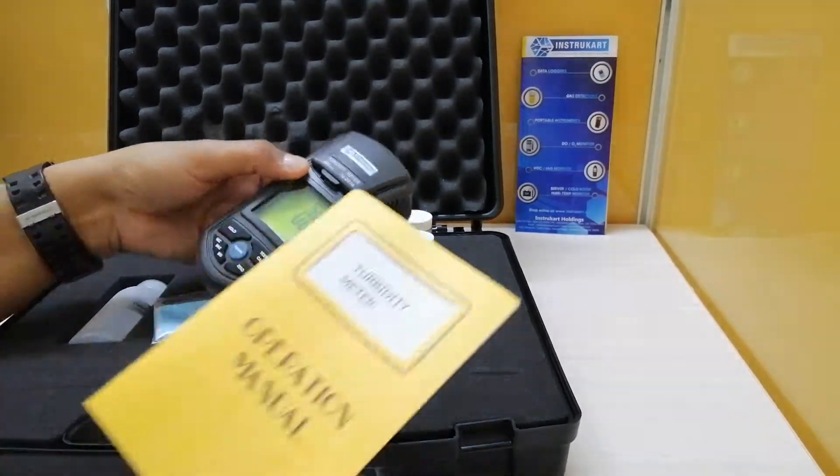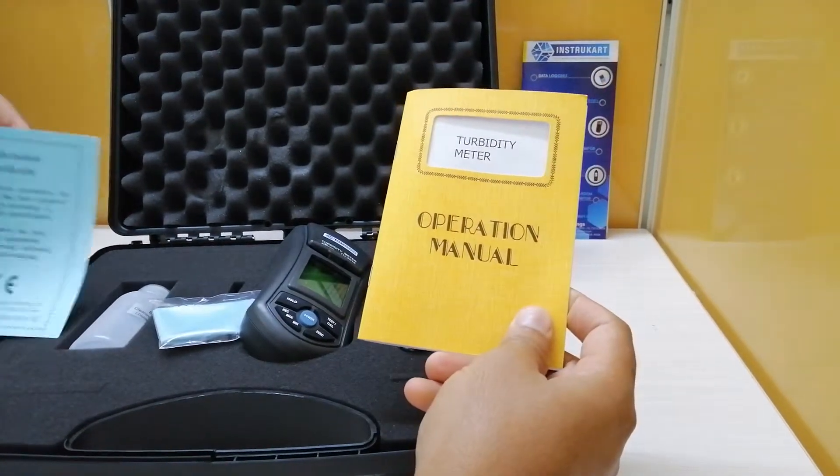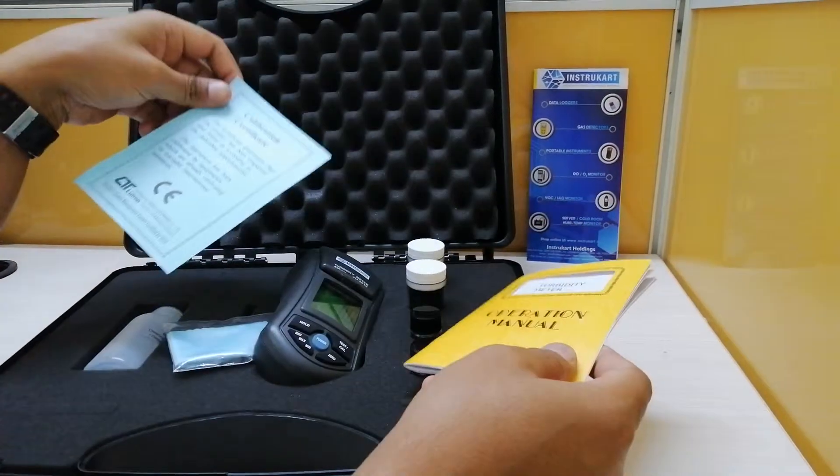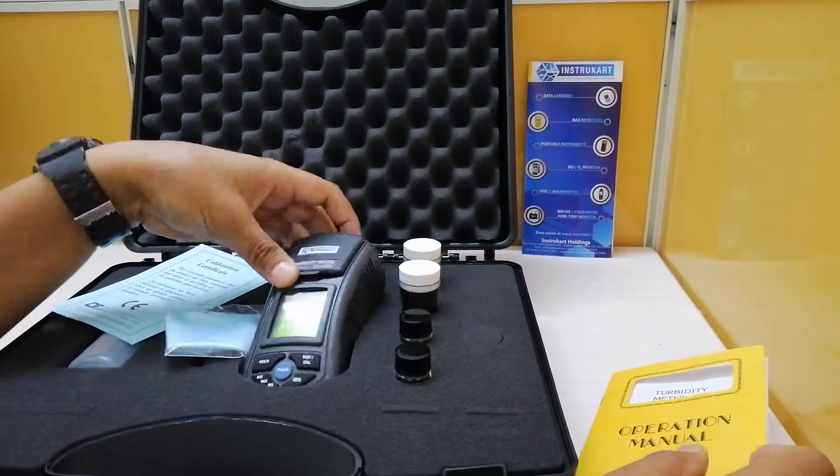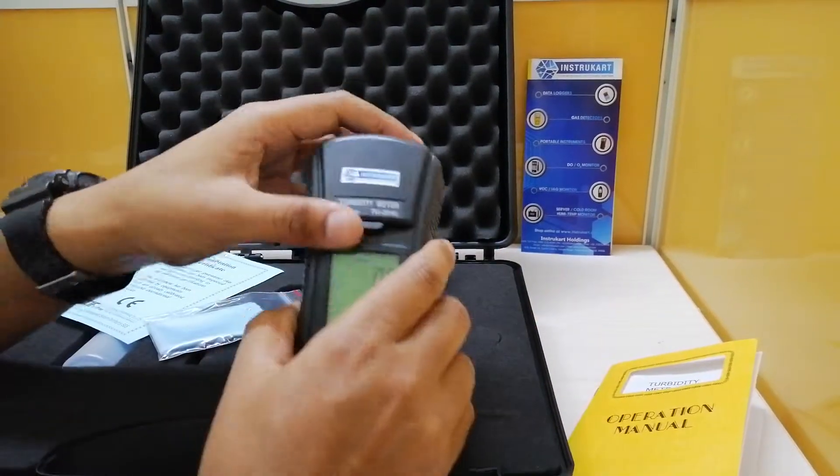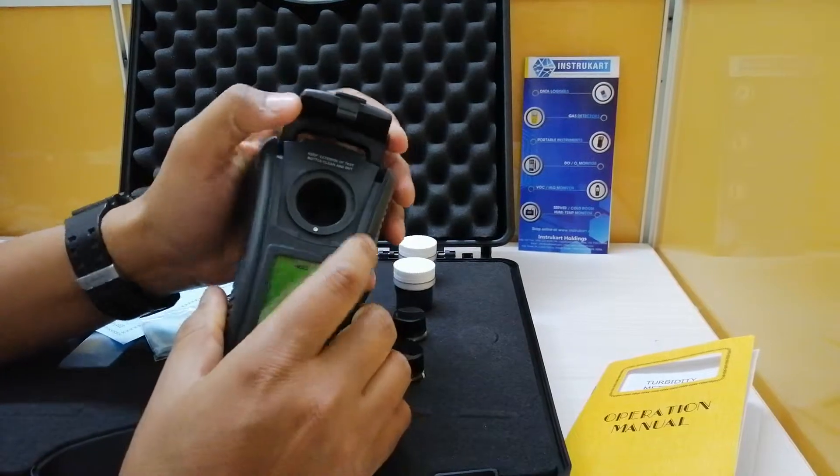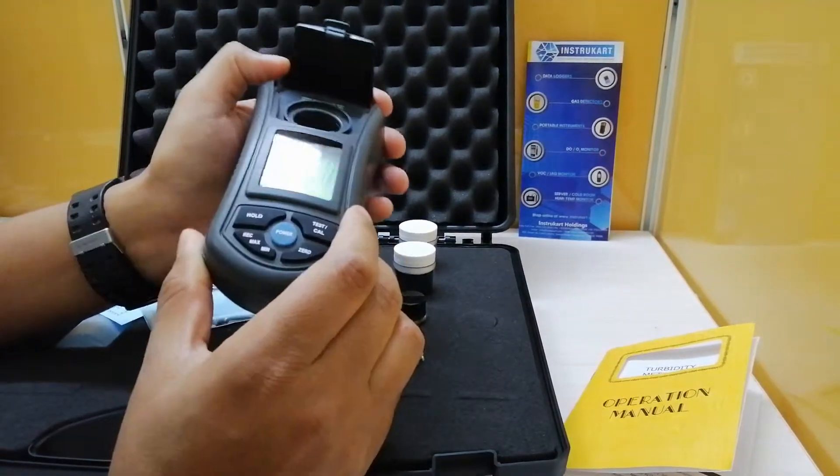You also get an operation manual along with this and a calibration certificate. This particular area is for the testing. You need to insert that and probably see the turbidity of the same.